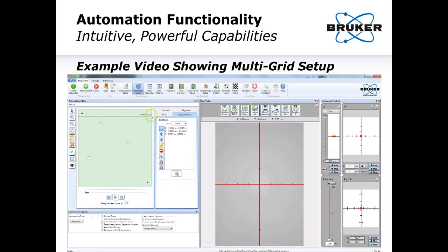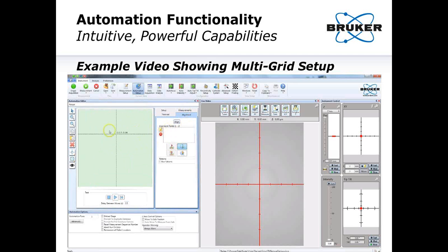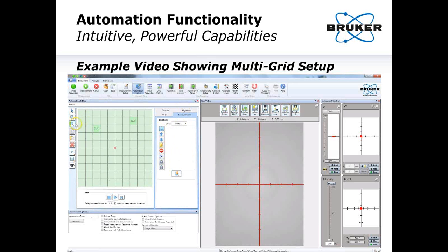You can do this in a very straightforward way and then zoom back out to the overall substrate and multiple grid. Now you see we've set our measurement for one location, and you can do the same thing at another site. And the interesting thing is this can be totally different from the initial site, where you have different alignment points and different location for measurement, which I'm showing in this example. But you can also copy the initial cell and paste it by using the functions that are shown on the left-hand side of the automation recipe editor. You can see very easily how quickly it is achieved to set up such an automation in multi-grid.